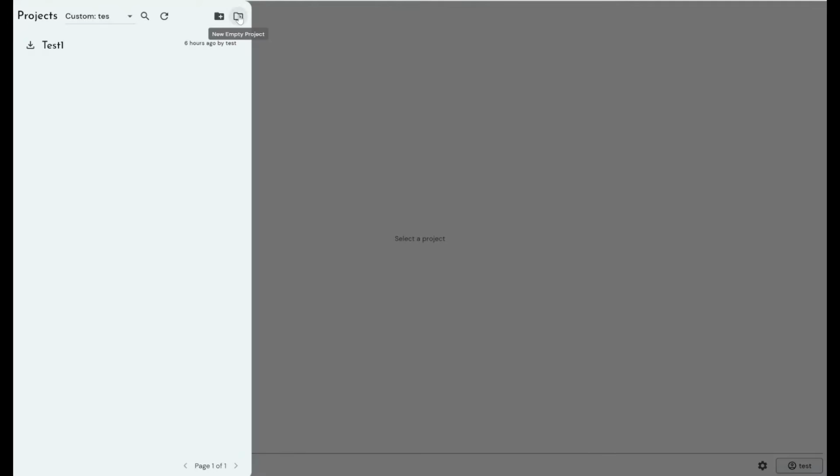Again, with all of Total Labs software, we are open to all vendors, all manufacturers. So if your piece of equipment has the ability for you to define where the data should be saved when it's created, you can use the new empty project to have an end-to-end audit trail from the moment the data was created through to analysis, all the way through to PDF report at the end, if supported by the analysis software. So that's a hugely flexible option for projects that rely on gathering data over time or not having the data ahead of time.